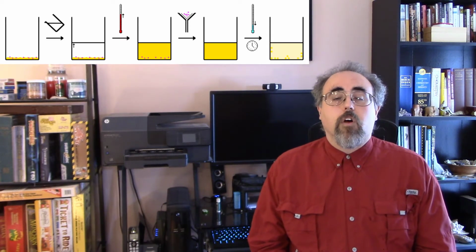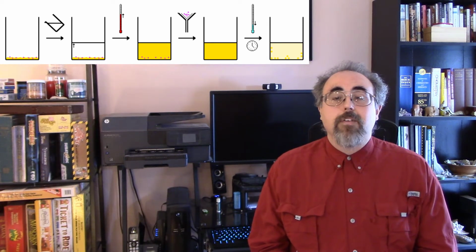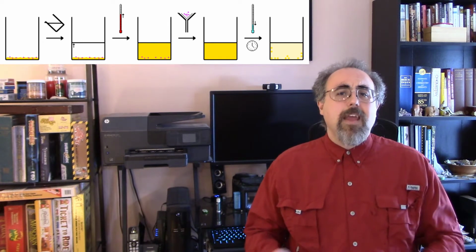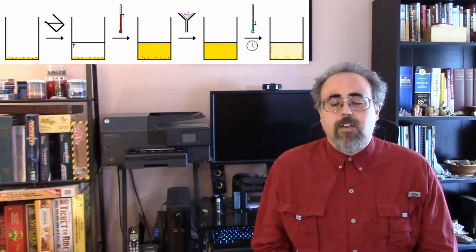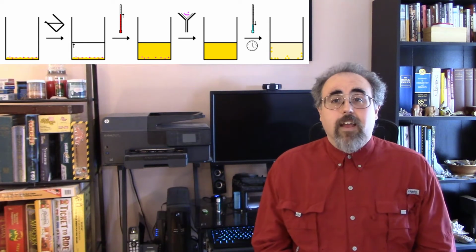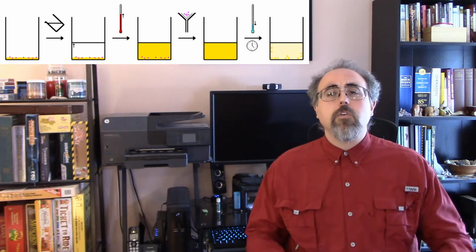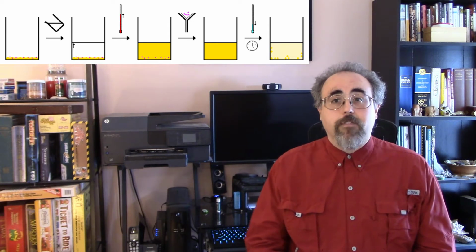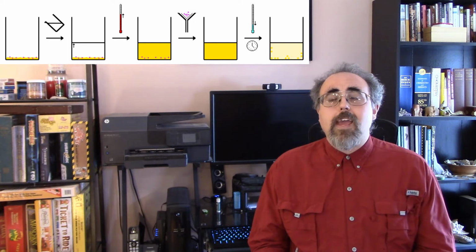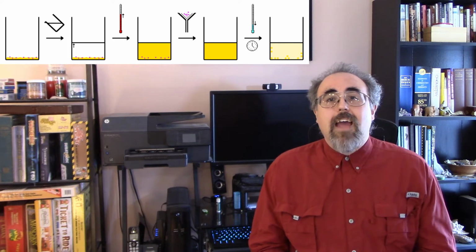A lot of material is more soluble in a solvent if it's warmed up. So what we can do is take a material that is in a matrix. So a matrix is all the random junk that your material is mixed in with. In a matrix that's solid, you can take some nice hot solvent, pour it over. You don't use too much. You don't want a ton of solvent here because you want to get rid of the solvent later on. So you take some nice hot solvent and you pour it over your material and then you filter it.